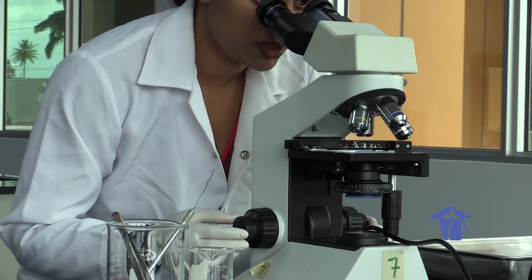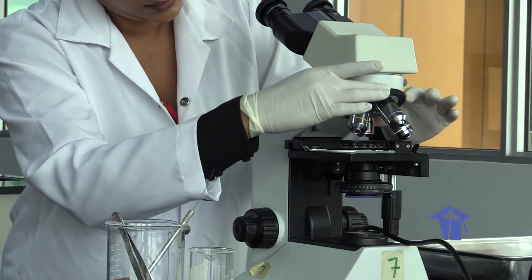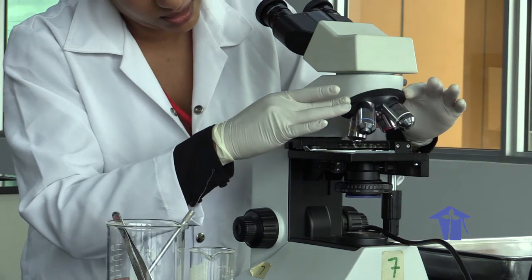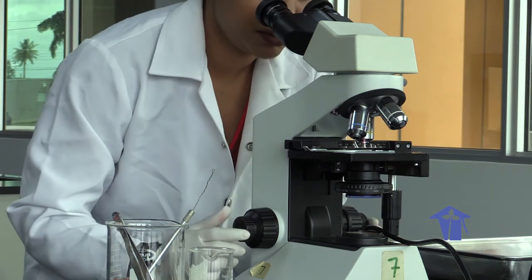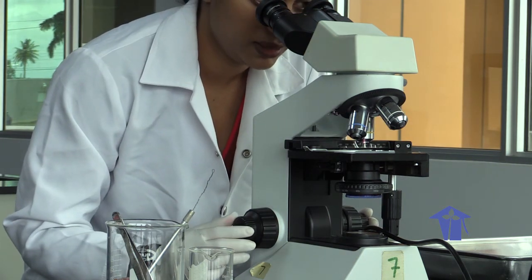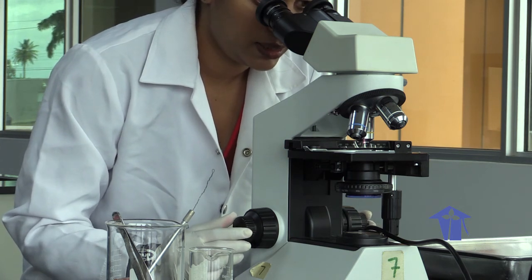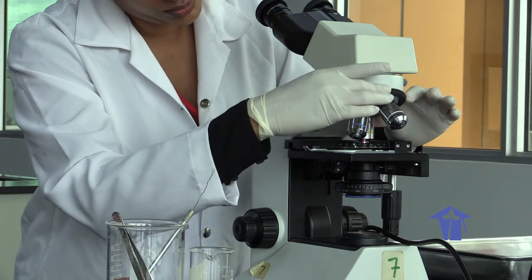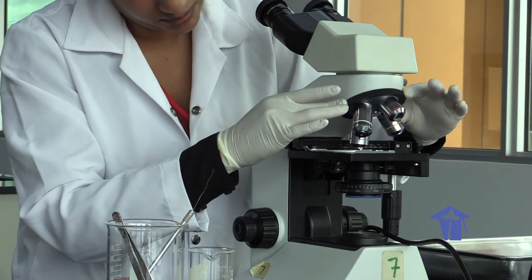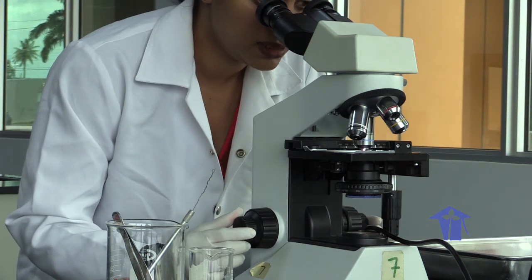Once you have a clear image at your 4x objective lens, you can then rotate to your 10x magnification. This will allow you to see some more morphological characteristics of the organism as we increase our magnification. Again, using your fine-tuning knob, you get a clear image of the organism. And we can go up to our 40x magnification to get a final idea of what our specimen looks like.